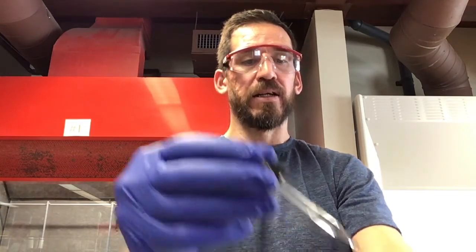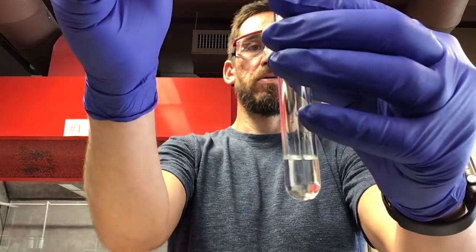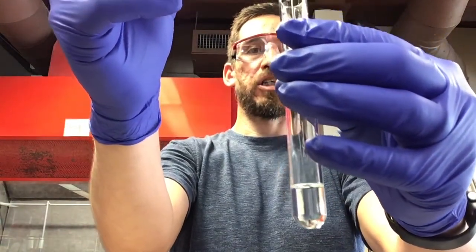Okay, so bromocyclopentane. That last one, number 9, was bromocyclohexane. This one right here is bromocyclopentane. 1, 2, 3, 4, 5-ish.